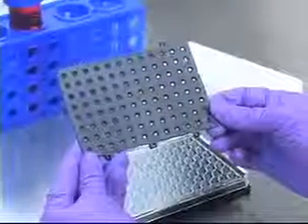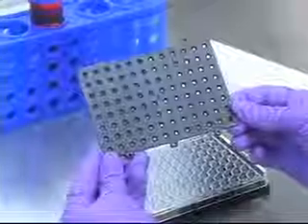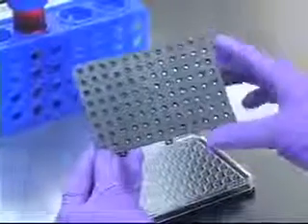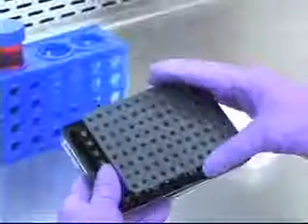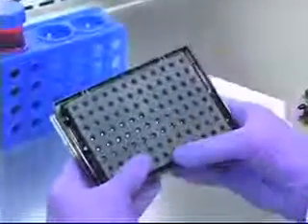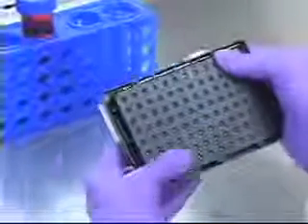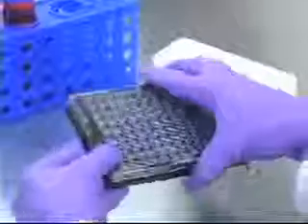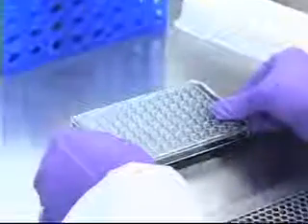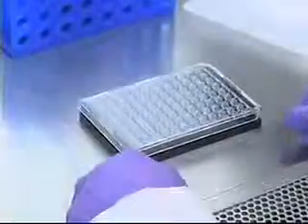To begin the assay, if you will be quantitating the cell migration using a fluorescence plate reader, snap on the detection mask to the bottom of the plate prior to seeding your cells. This detection mask allows only the fluorescence from the cells that have migrated into the center of the well to be detected. The mask is not required if the results will be viewed microscopically.